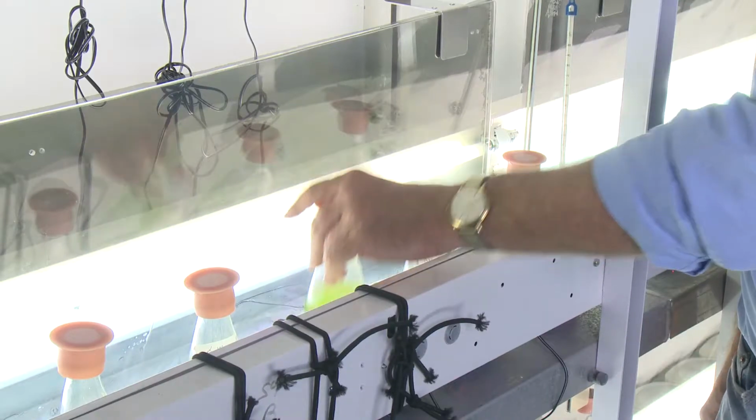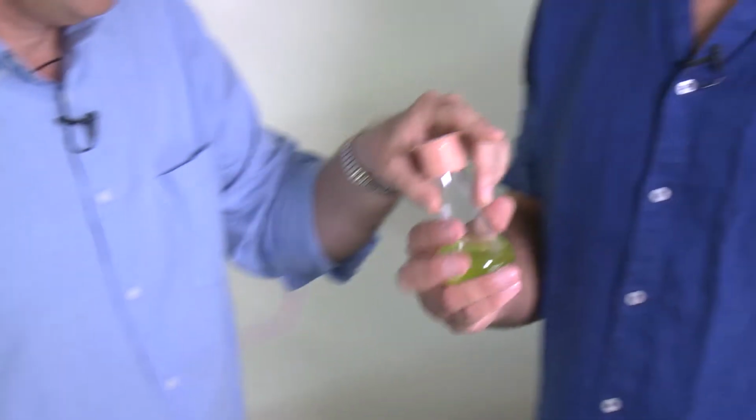So we're now in the laboratory of Dr. Yiftach Yacobi, one of the young researchers at Tel Aviv University. And as I said, Yiftach is an expert on photosynthesis. So Yiftach, can you tell us what are these green things we have growing here?